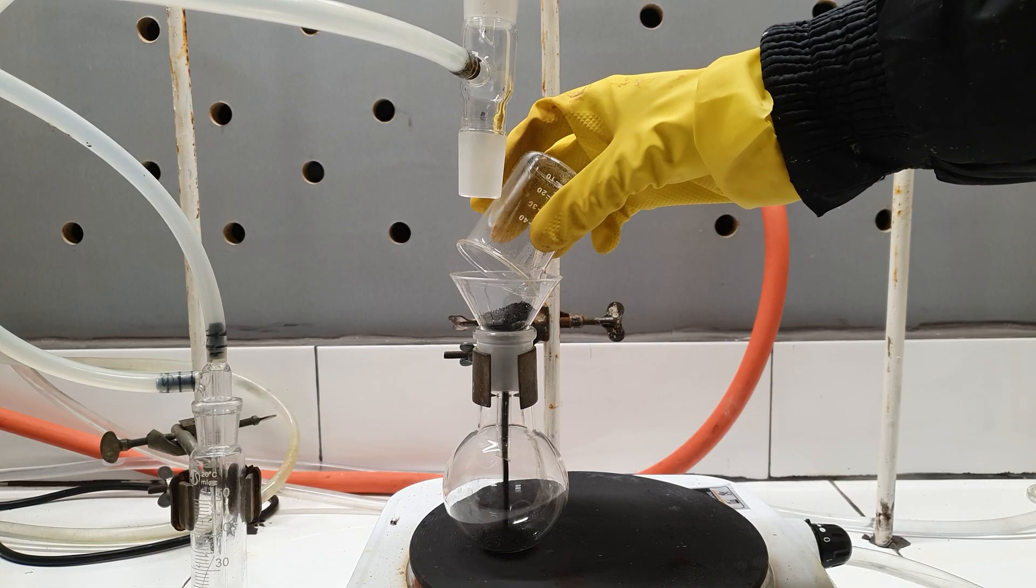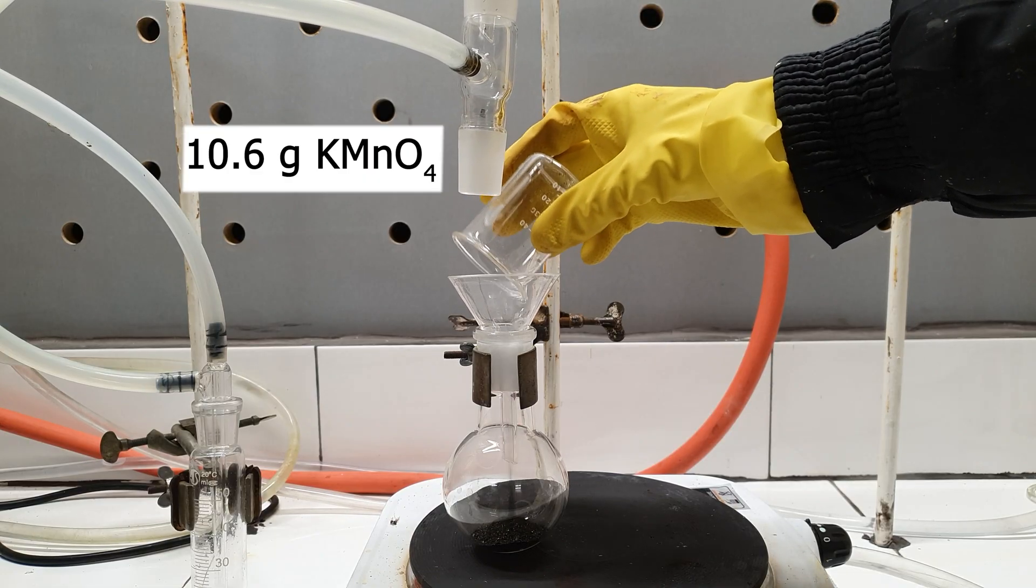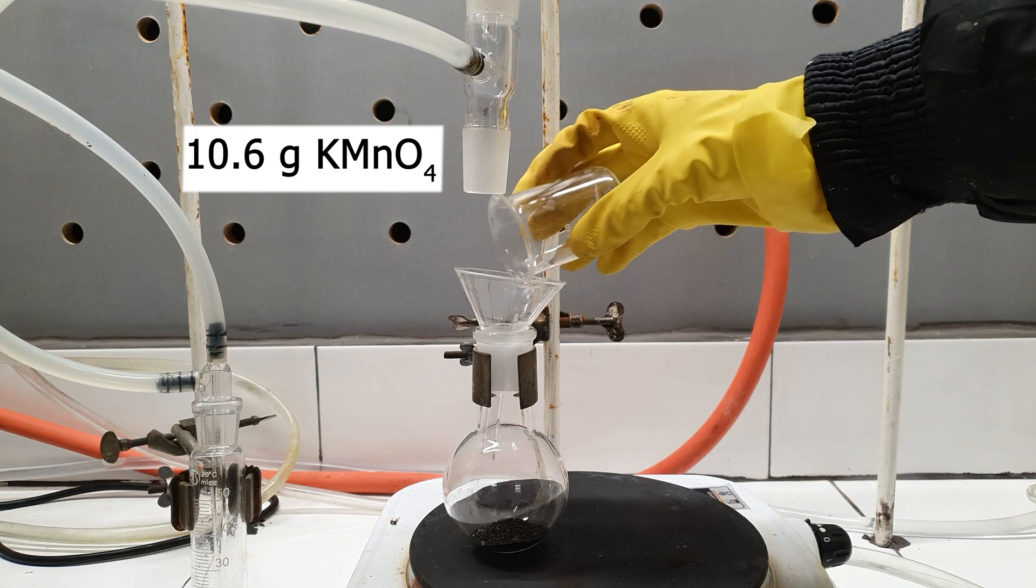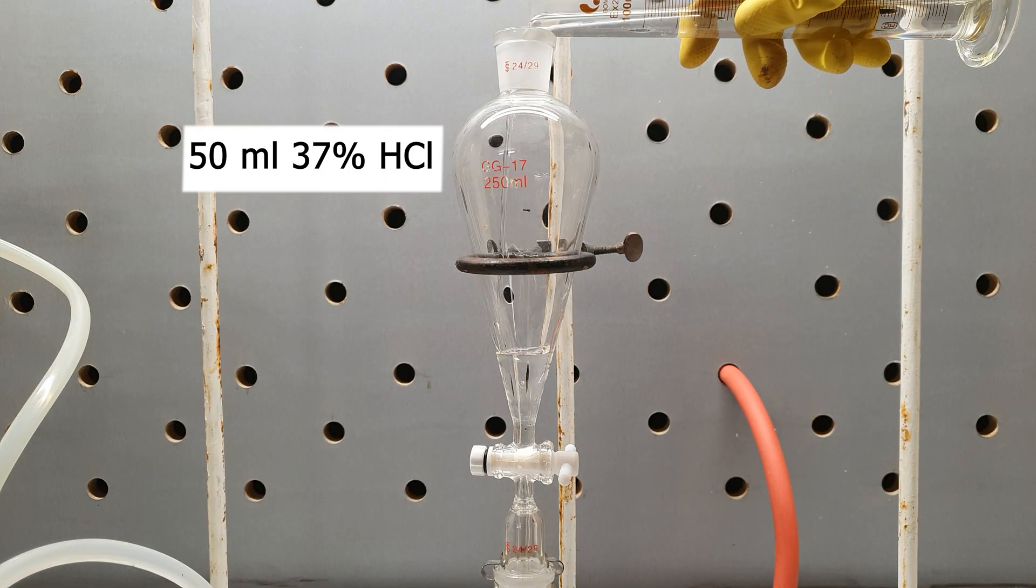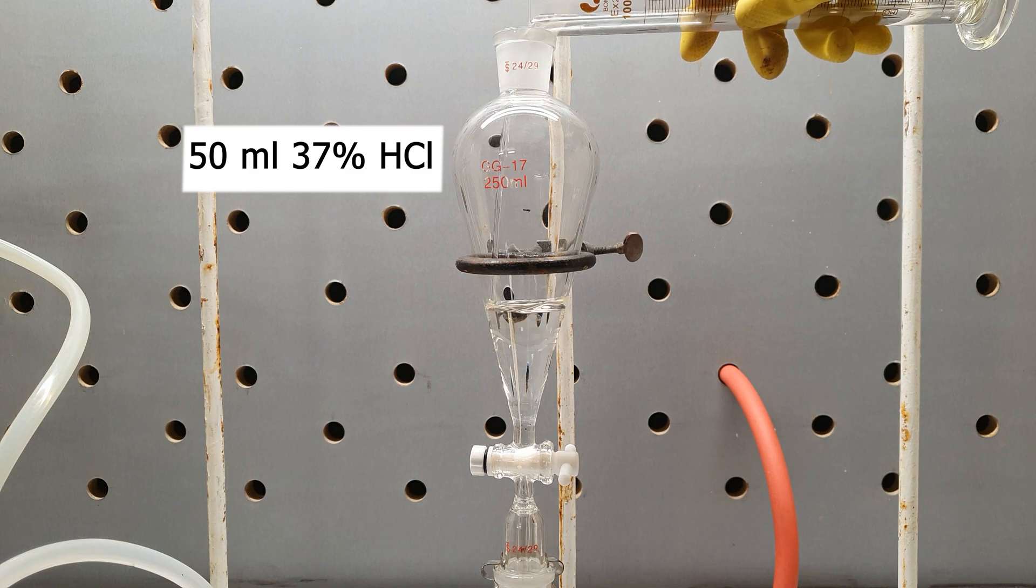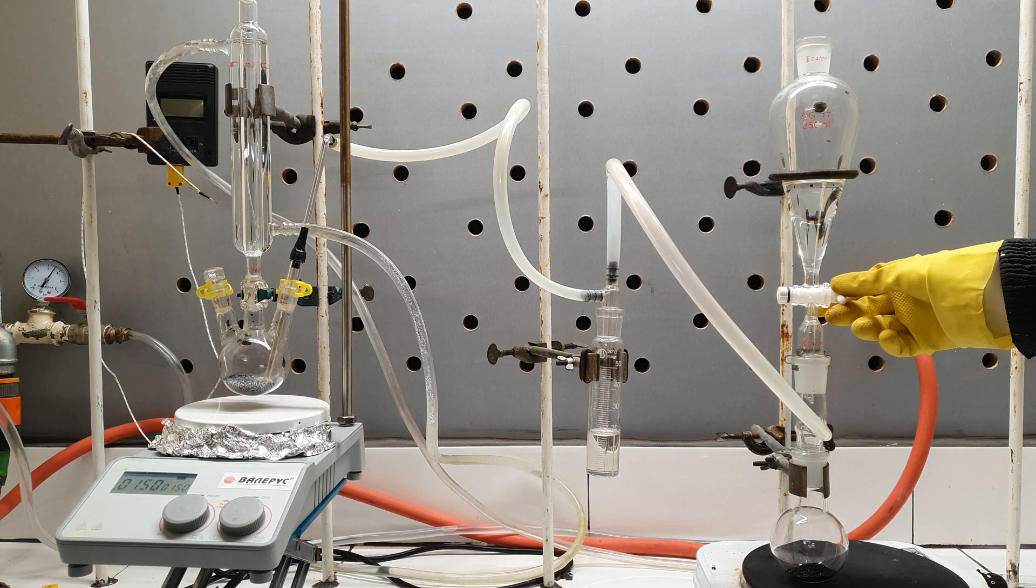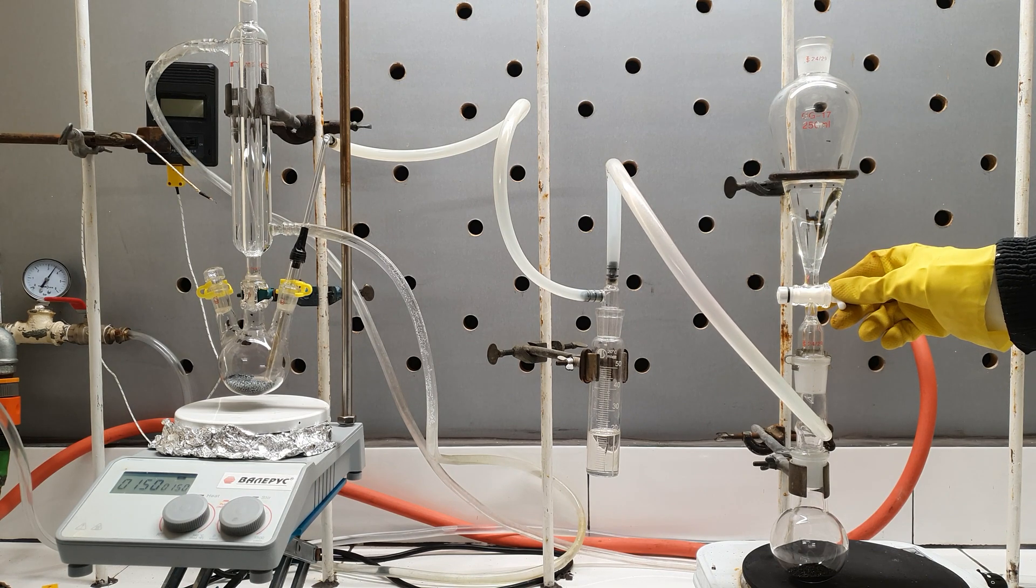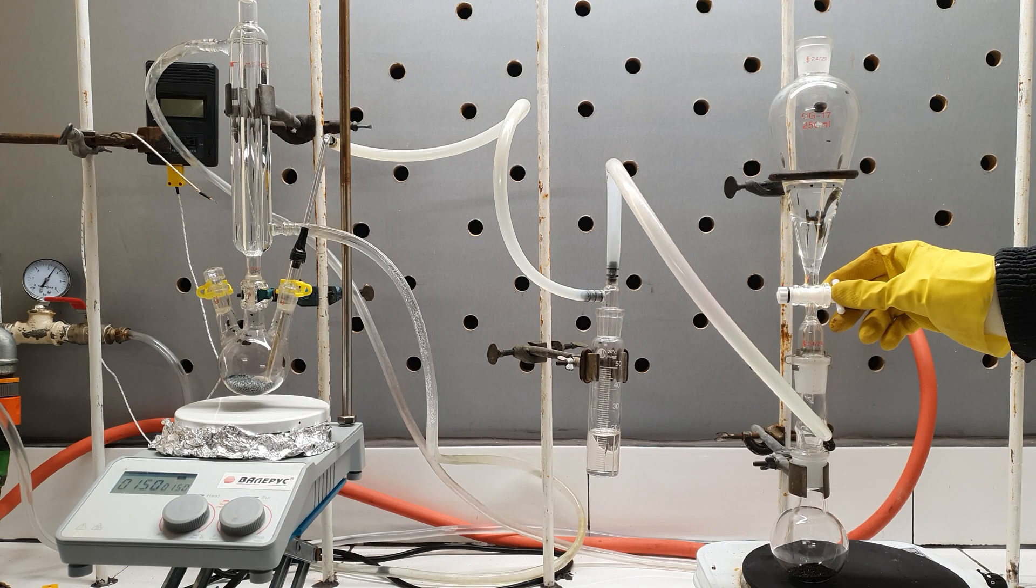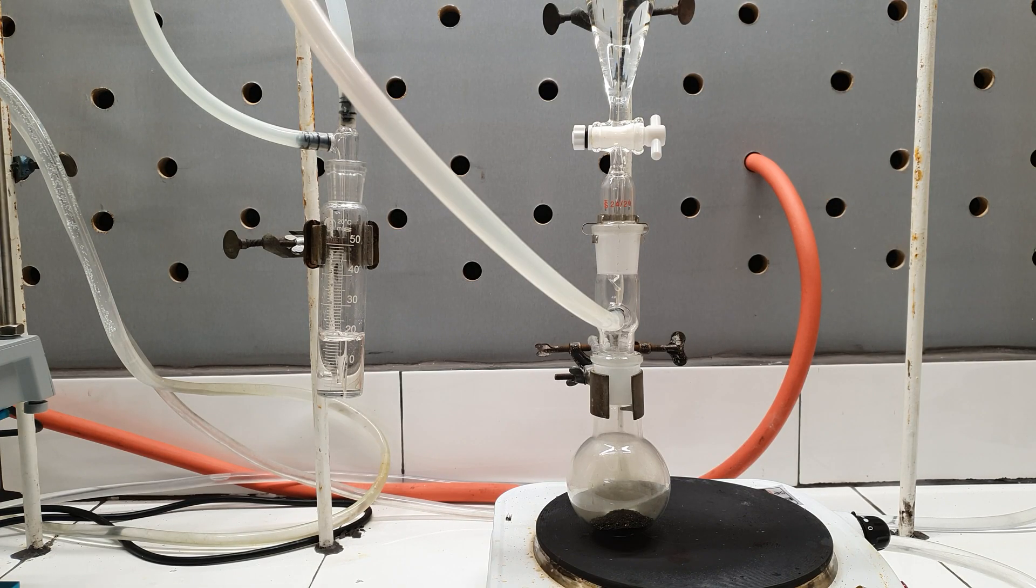The chlorine generator flask is charged with 10.6 grams of potassium permanganate. The funnel on the top was filled with 50ml of concentrated hydrochloric acid. When everything was ready, I slowly rotated the stopcock, allowing some of the acid to drip in the permanganate. Immediately, a vigorous reaction followed, which you can tell by the rapid bubbling in the drying flask.